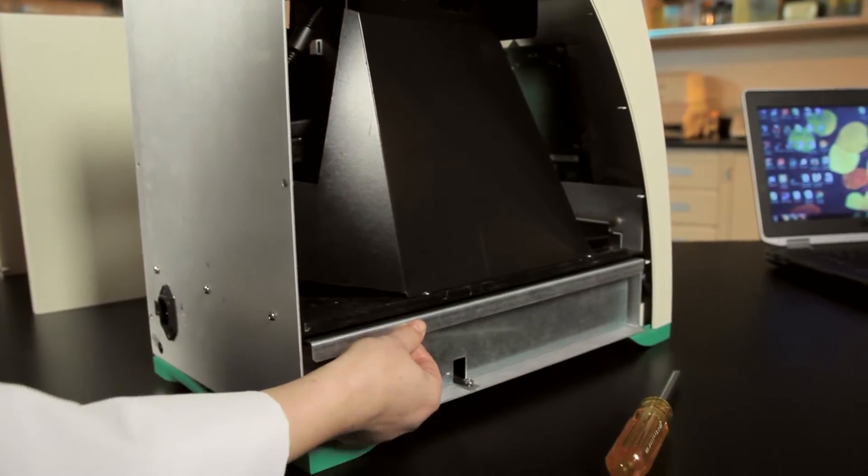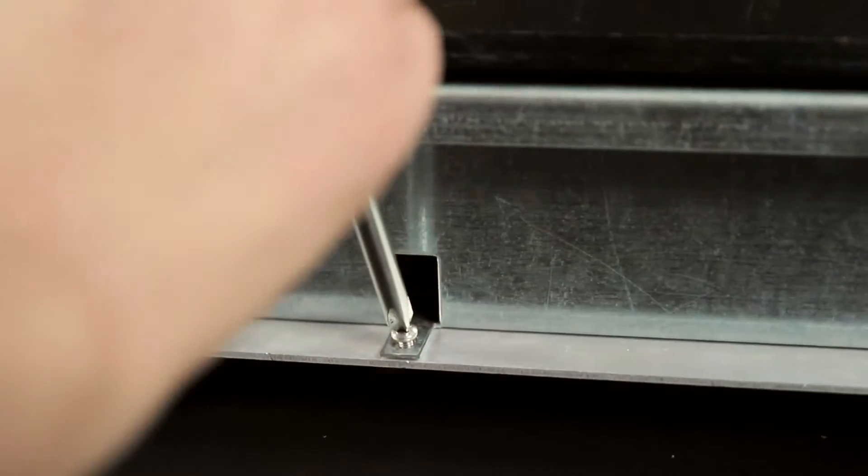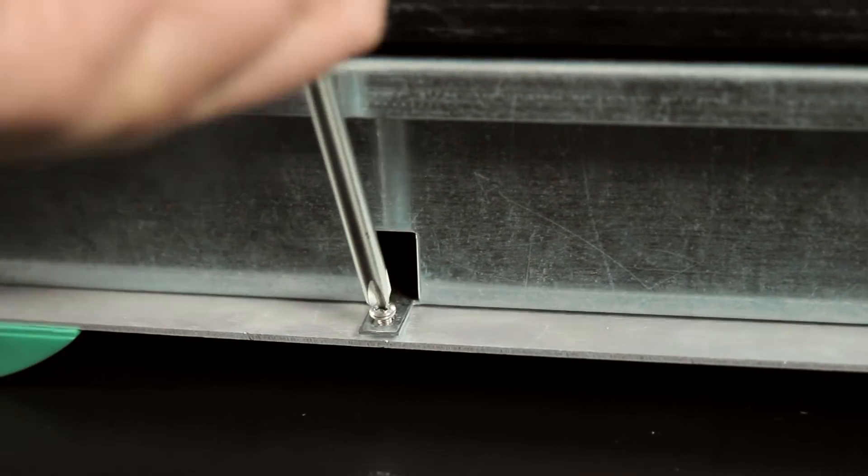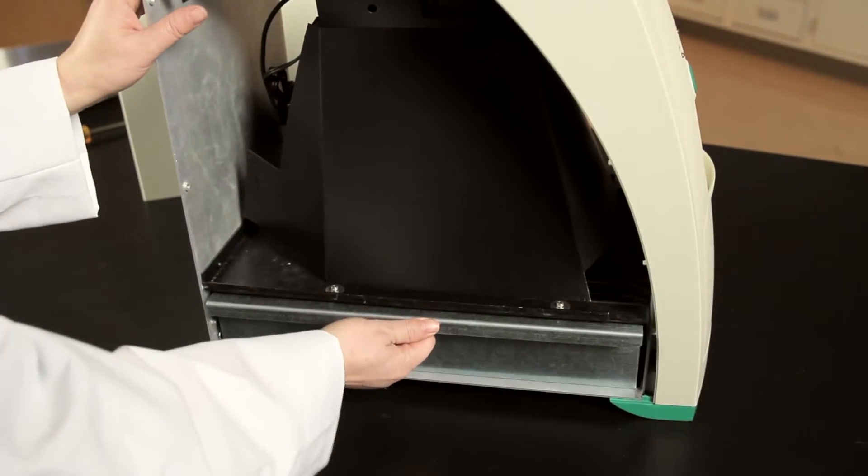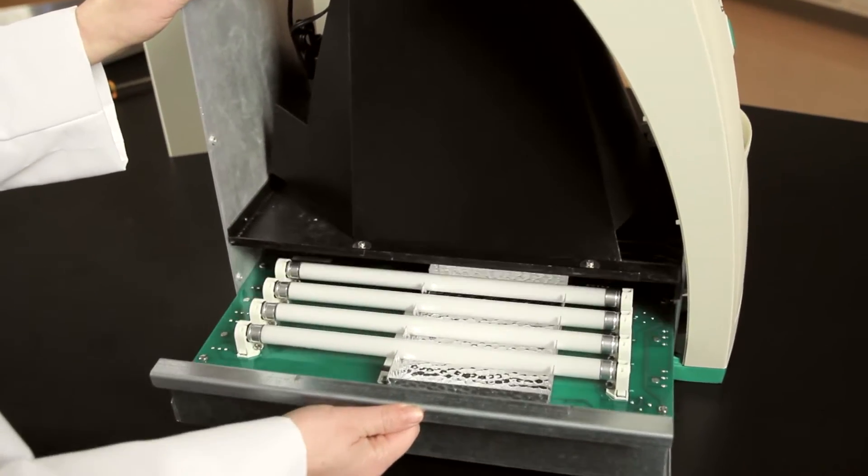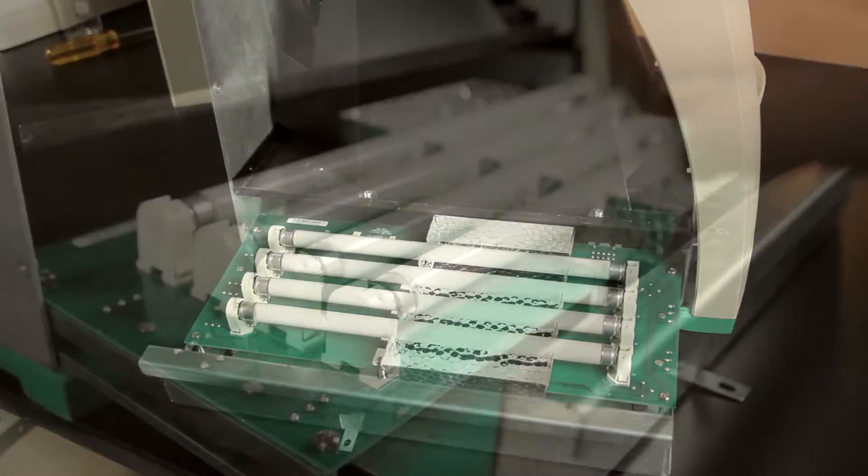Now locate and remove the screw holding the lamp assembly drawer in place. Slide the bulb drawer out until you see all four lamps. The drawer may stick at first, so you might have to give it a firm tug.